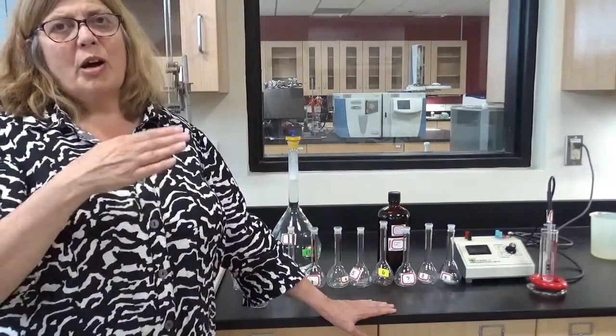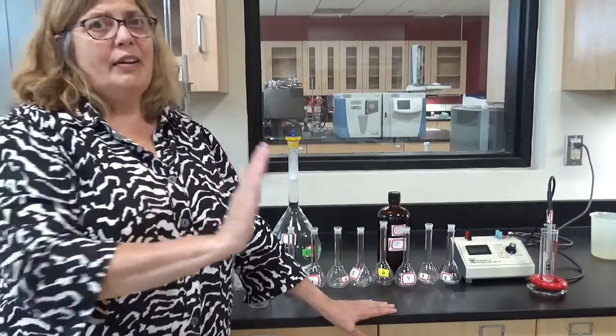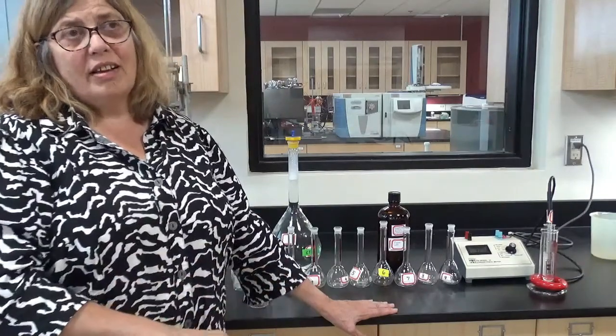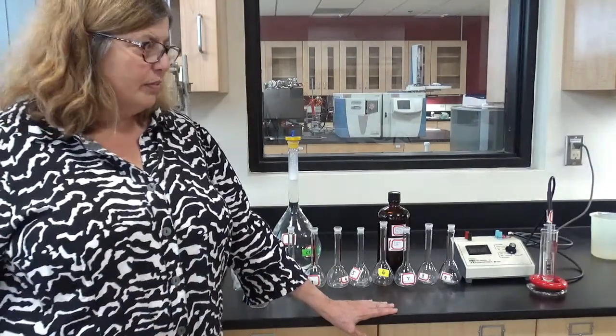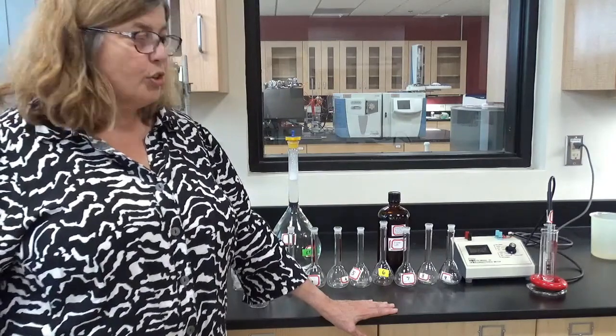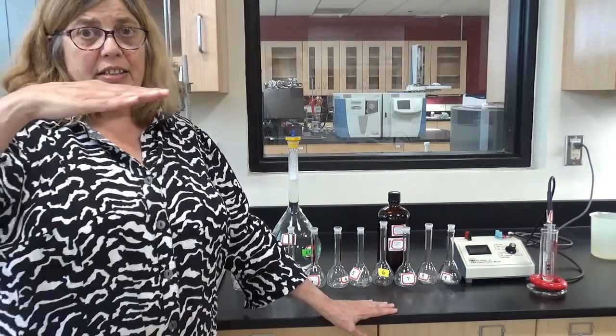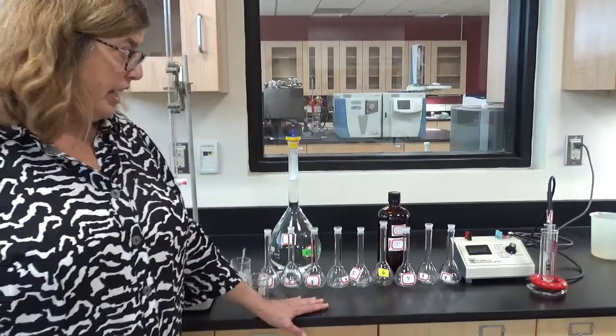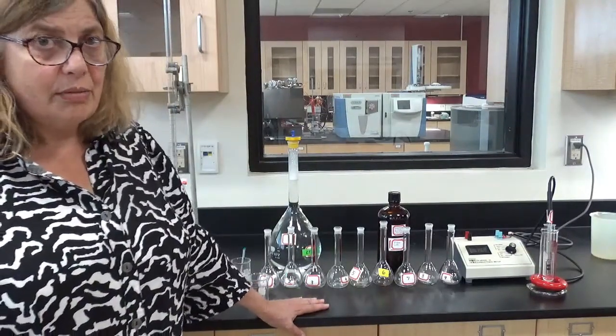And as the number of micelles increases after the CMC, more and more phenanthridines go inside of those micelles, and that fluorescence gets quenched quite a bit, so it goes down a lot. So we're looking again for the break in the curve to see where that fluorescence quenching actually goes down. So those are the two methods that we're going to use.